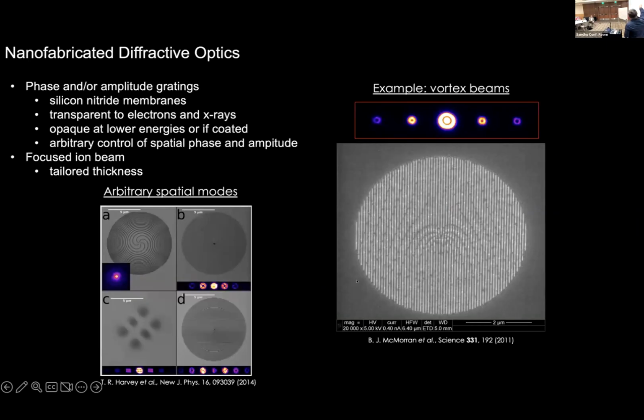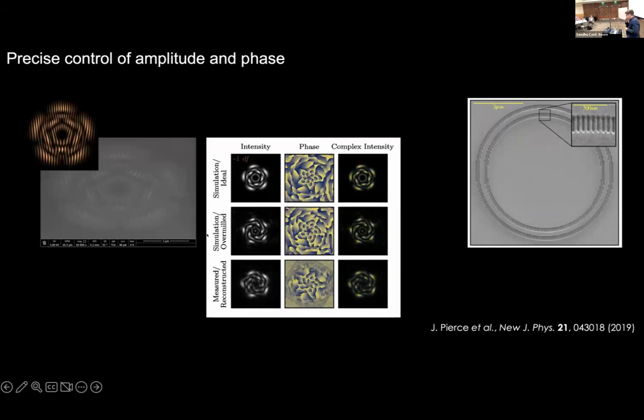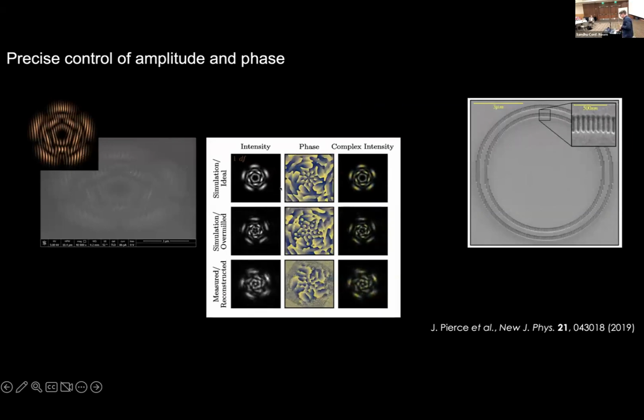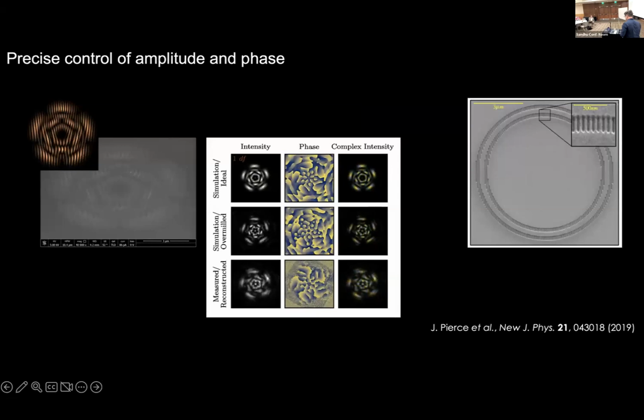There's gratings with a fork diffraction dislocation, and you can produce these electron vortex beams that carry this quantized orbital momentum, or other arbitrary modes, or Gaussian modes, superpositions thereof. You can reconstruct phase after producing these, so it's a focal series of electron beams that have this interesting three-dimensional structure in free space.